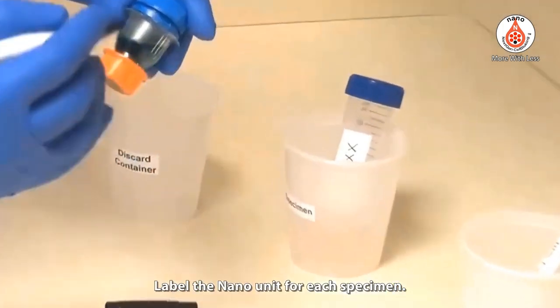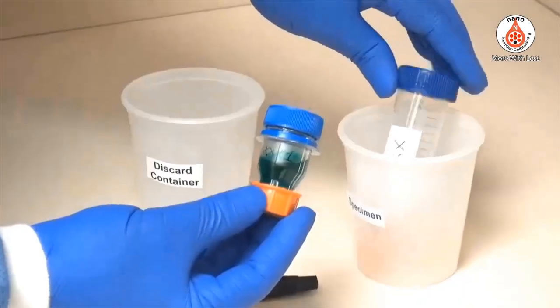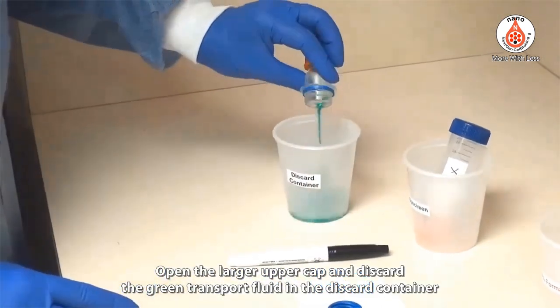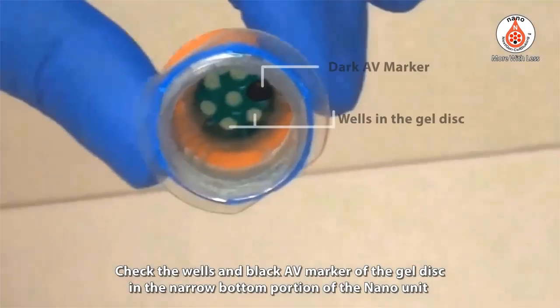Label the Nano unit for each specimen and check the labeling on both the Nano unit and the specimen. Open the larger upper cap and discard the green transport fluid into the discard container. Check the wells and black AV marker of the gel disc in the narrow bottom portion of the Nano unit.